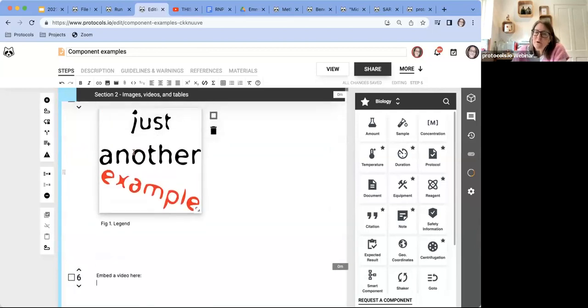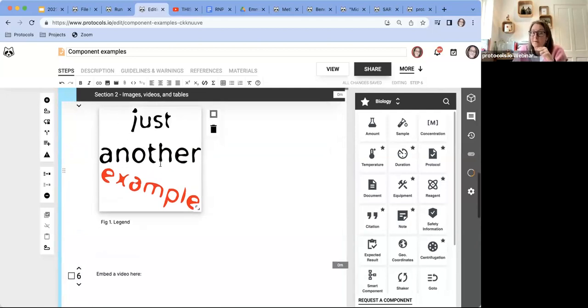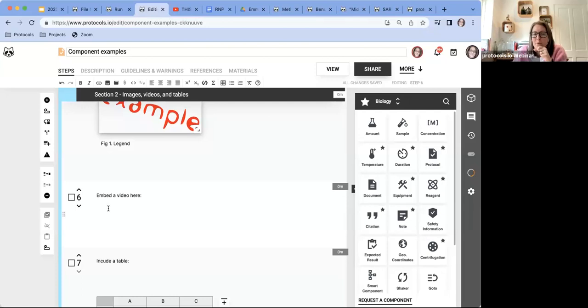As noted, you can put a short video that's not bigger than, I forget what the file limit is, but there's a help page with the file limit. So if it's a short video off your phone or something, you can add it in that way. If you have a more detailed video that you want to add in that's longer and larger, you can put the video somewhere like YouTube or Vimeo and then grab the embed code. So I will show you how to do that.